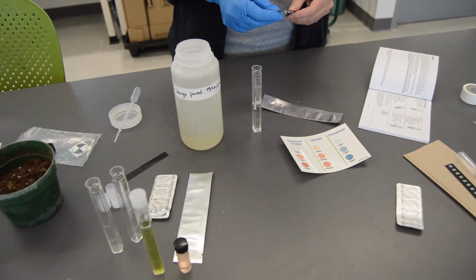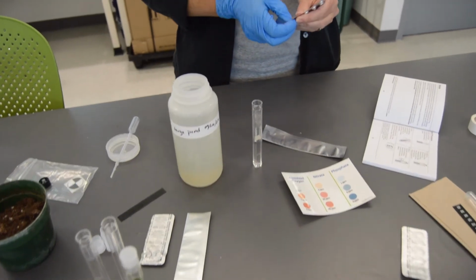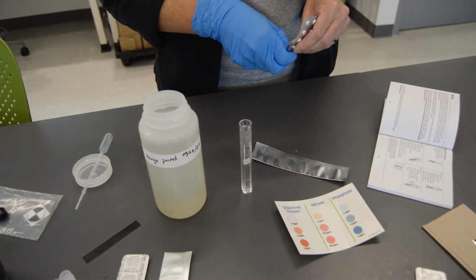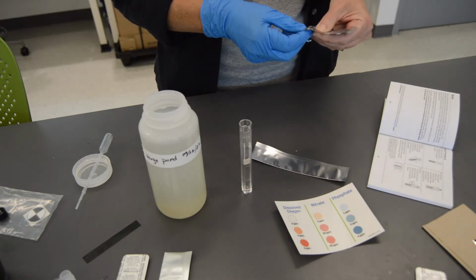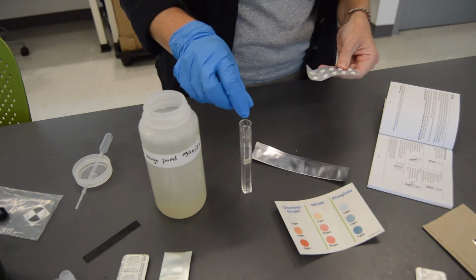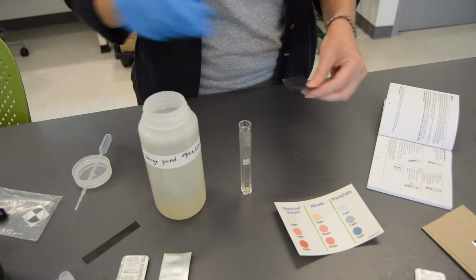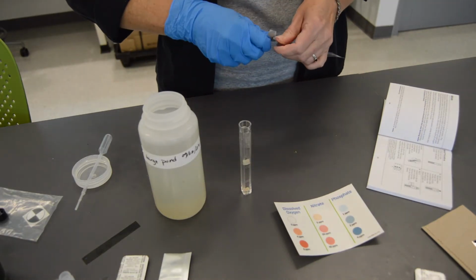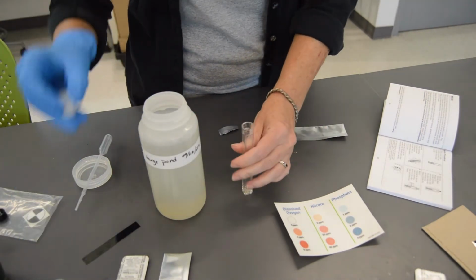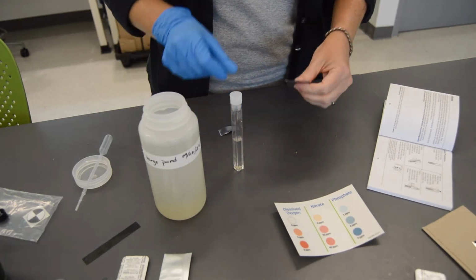And then we're going to add our test sample, our test tab. If I can get it out of there. So we have our test tab for nitrate. I'll drop that in there. And then we actually want to protect this one from light during the process. So I'm going to pop the cap on there and put it in the protective sleeve that comes with the kit.